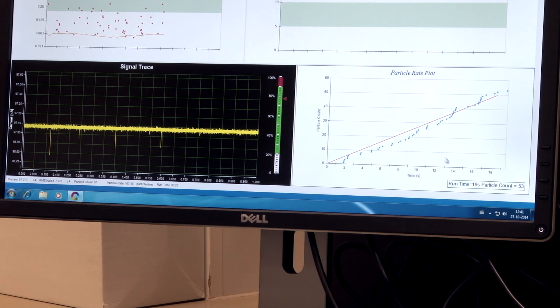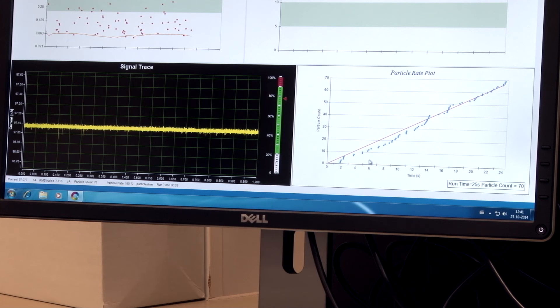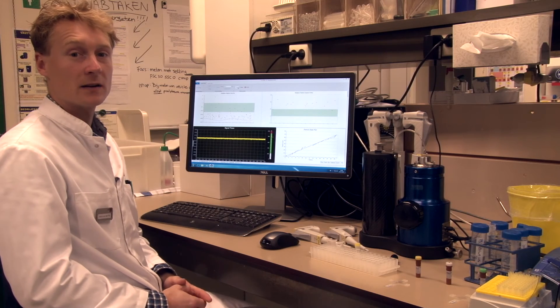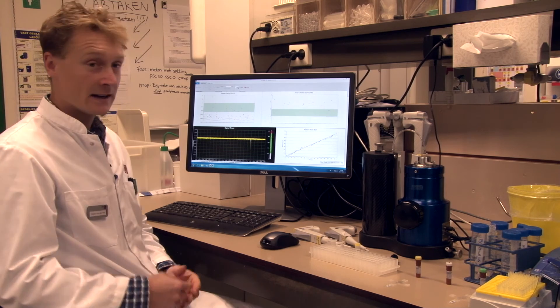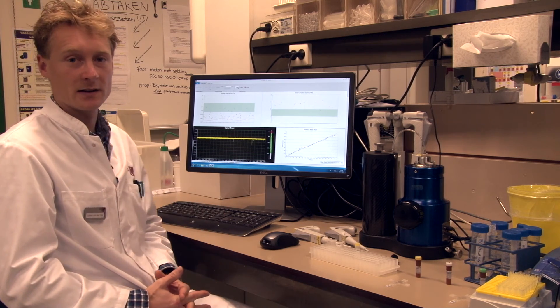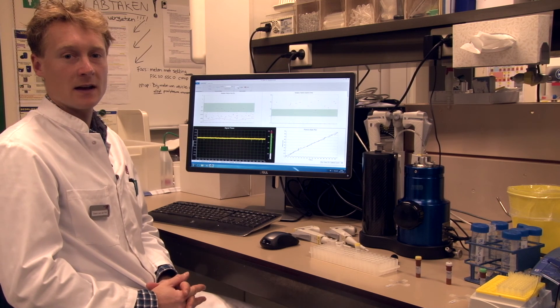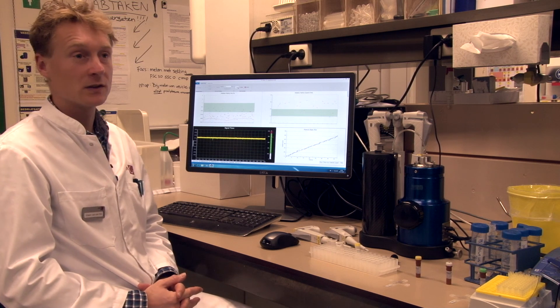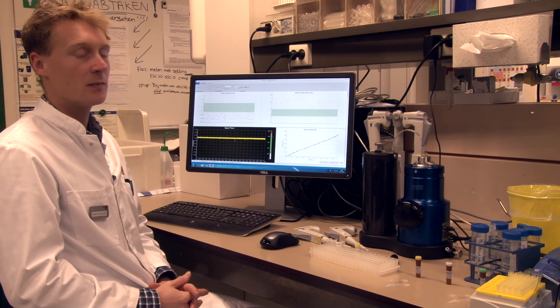On the right, you can again see the cumulative particle count against time — we expect a straight curve. We continue the measurement until we have 1,000 particles measured. Afterwards, we calibrate this measurement with our synthetic reference material, and by this comparison we are able to obtain the size and concentration of our extracellular vesicle sample.